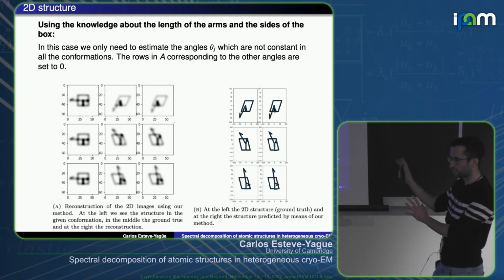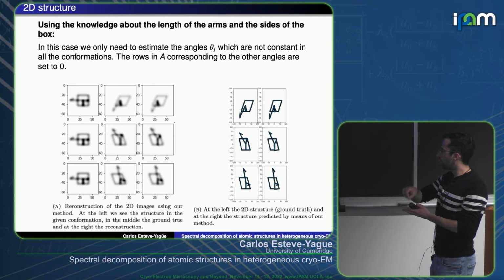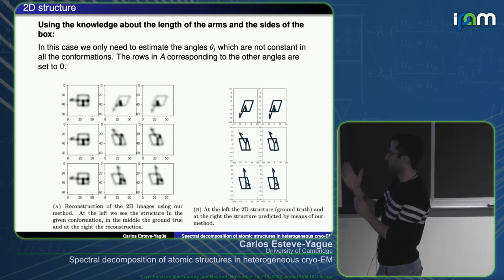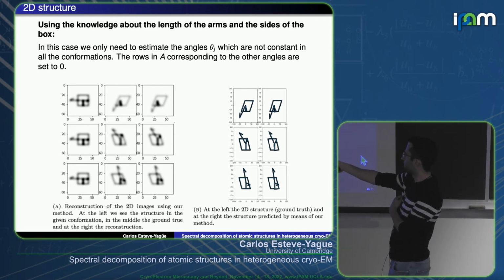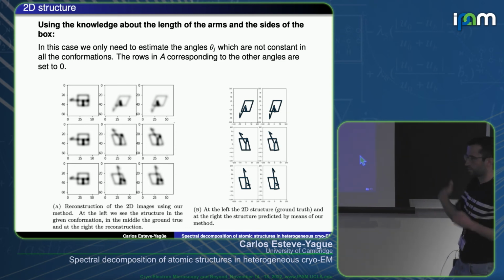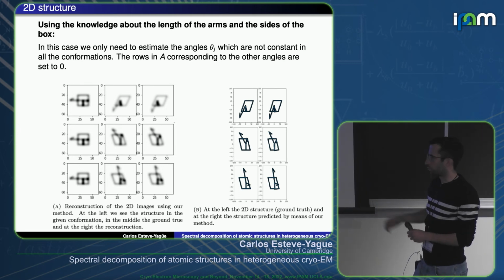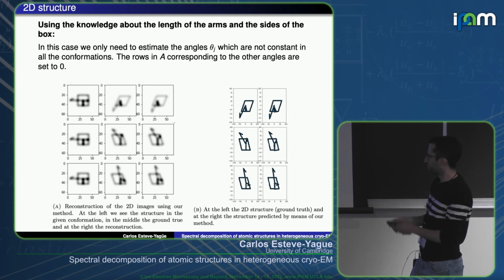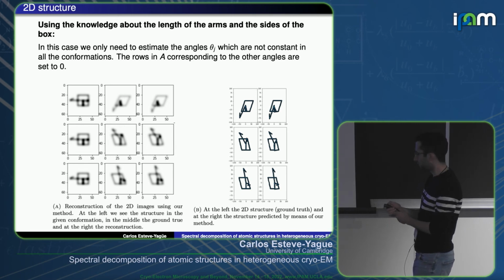But this is, of course, a very idealistic scenario where you know exactly what atom is being deformed. But the idea of preserving these straight lines is maybe something that can somehow be used in a real case scenario where you have these helices that will be transformed rigidly from one conformation to the other.